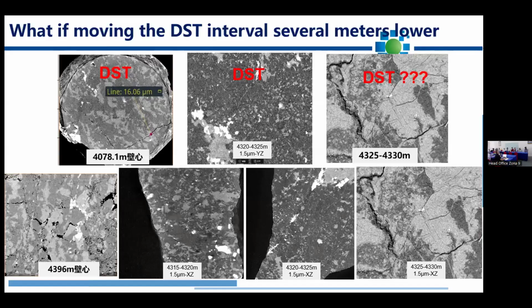Let me just go one by one. For two levels: for direct results like the porosity or pore distribution, you don't have to consider too much. You basically get the image and do statistics based on samples. But the second part of your first question is critical, and is more region or basin related.